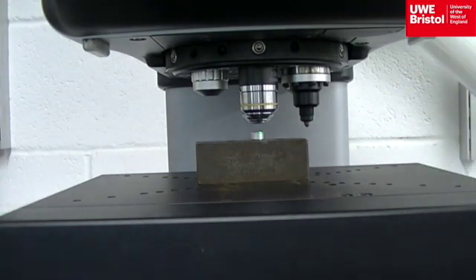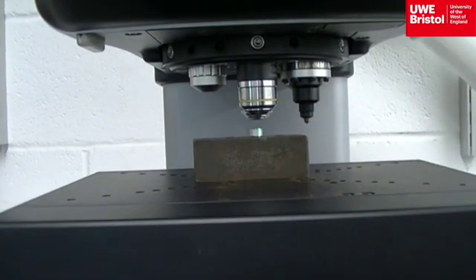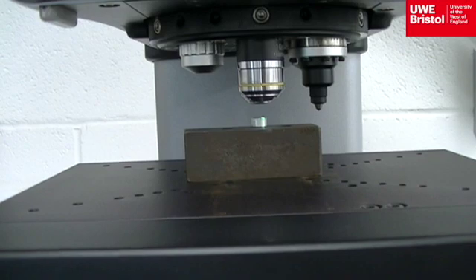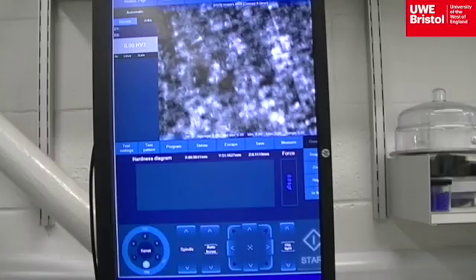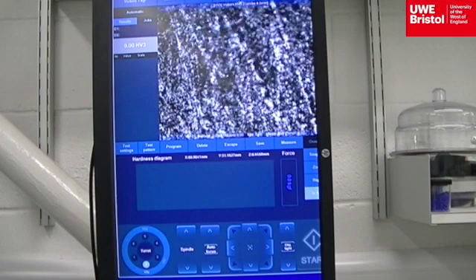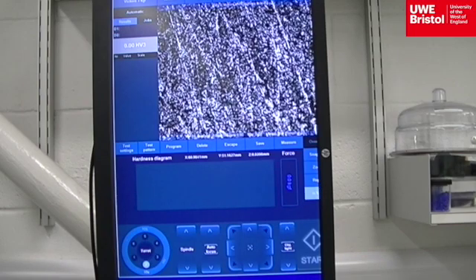Be cautious not to crash the platen into the indenter while viewing the image on screen, and also moving the platen up or down with the triangular buttons to focus the image. The adjacent wheel is used for fine focusing of the image.